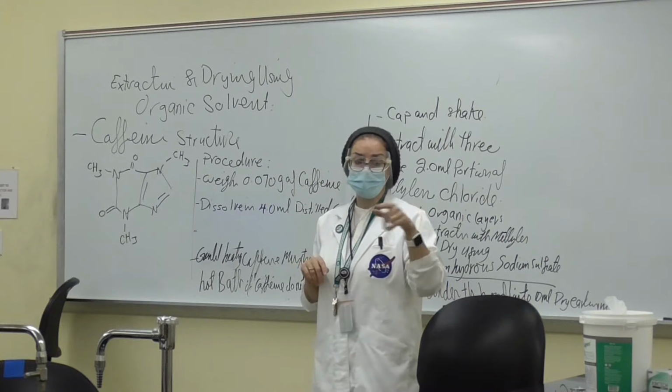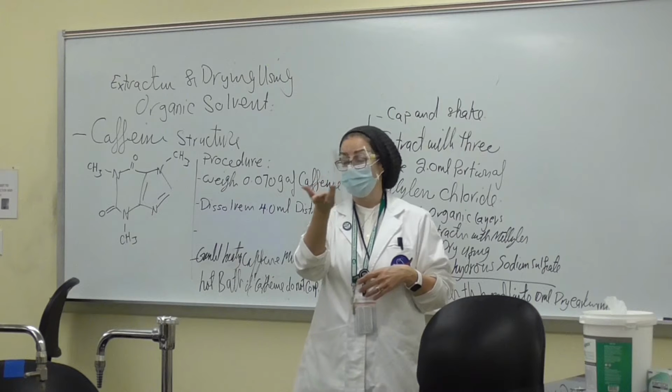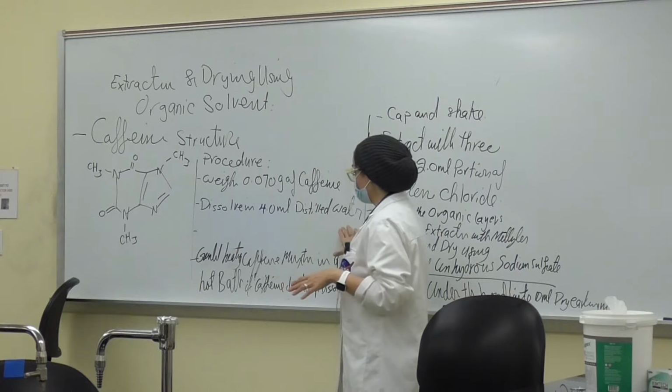All the tables should have a distilled water bottle, and you can measure it. You have all the other equipment, like cylinders and everything, in your drawers. And then you're going to mix it.